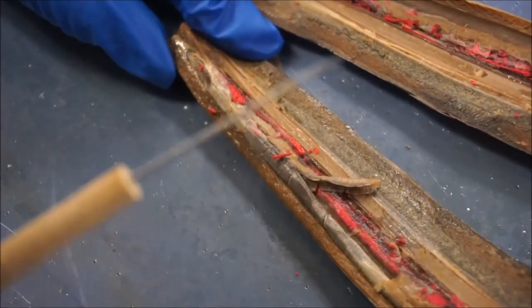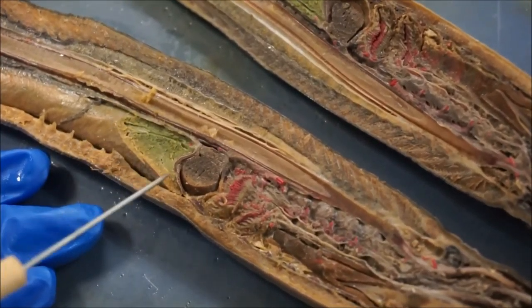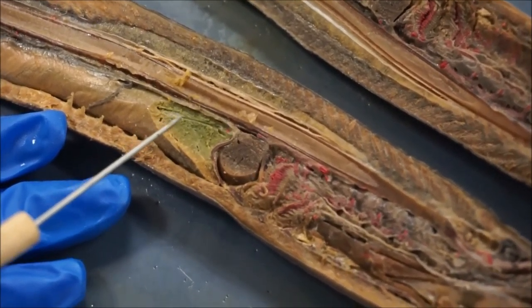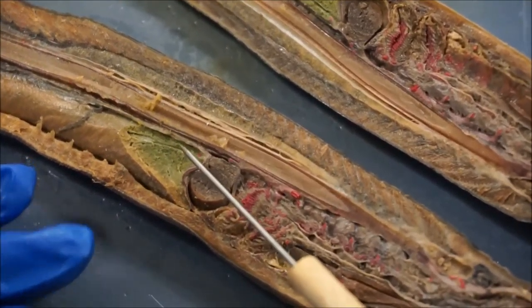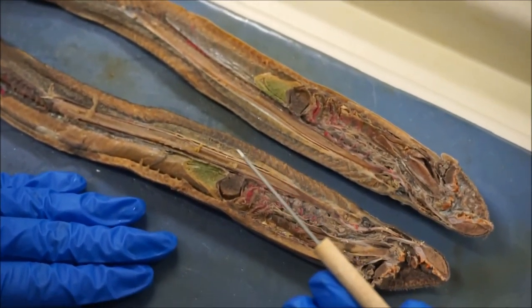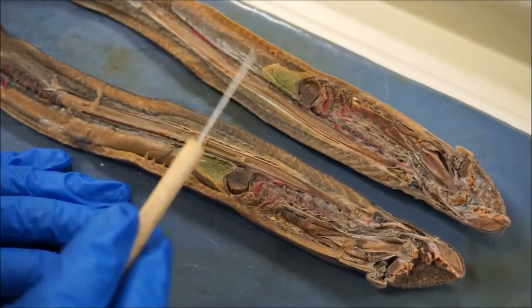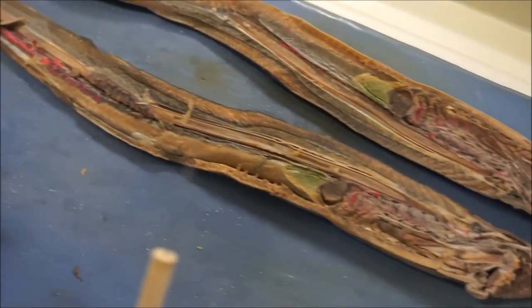The intestine comes all the way out to the end where this is going to be the anus, and that's obviously where all the waste comes out. Back up here, this little green section is going to be the liver, and posterior to the heart is the gallbladder. The liver functions to metabolize carbohydrates and fats, which obviously serves for quick energy production. The gallbladder stores and concentrates bile; the liver secretes the bile and delivers it to the intestines via the bile duct. Once all of that is finished, it goes through the intestine and comes right back out the anus as usual digestion would.